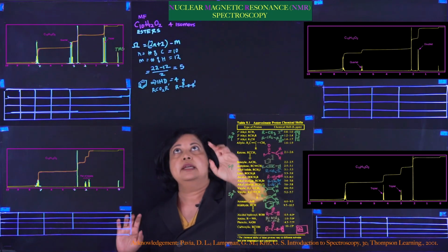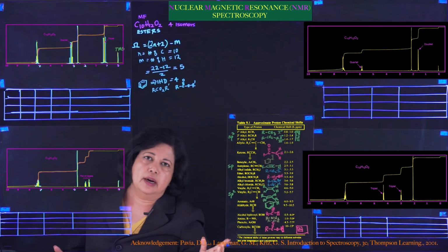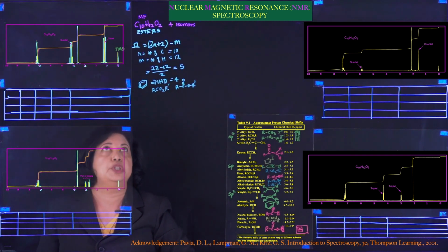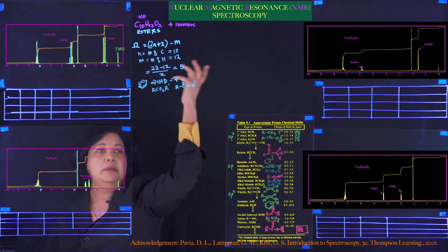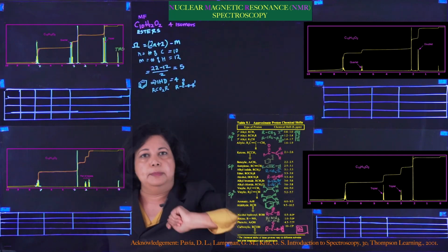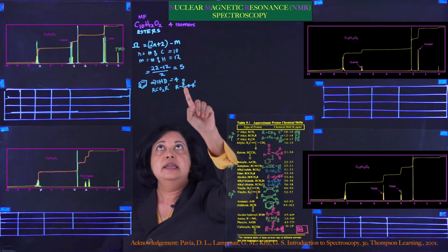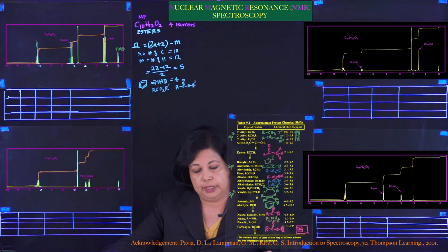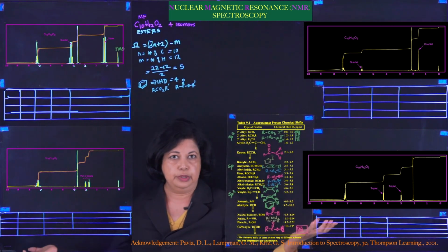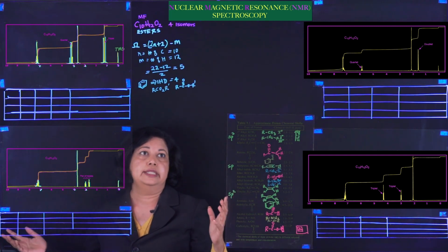And then we can take benzene out, which is going to be C6 and probably H5 or H4, depending on the number of substituents. And then you can come up with a structure for the other 4 carbons. We already know that we have a carbonyl, so the rest is going to be saturated, like CH2s and CH3s, or CHs that are all sp3s.